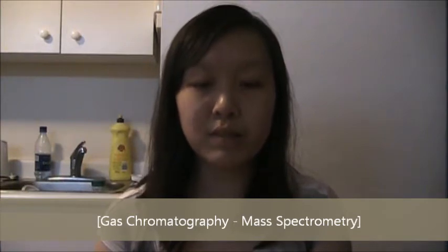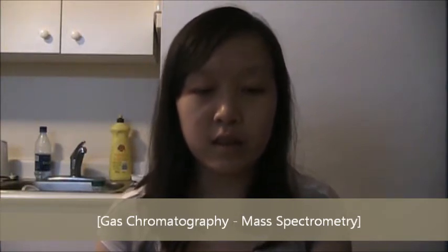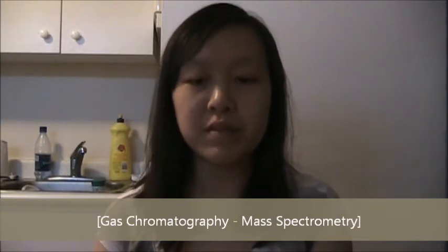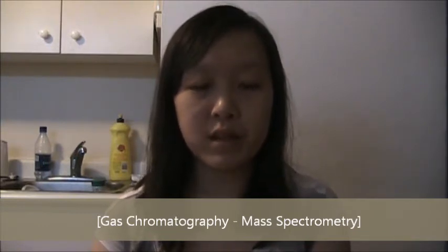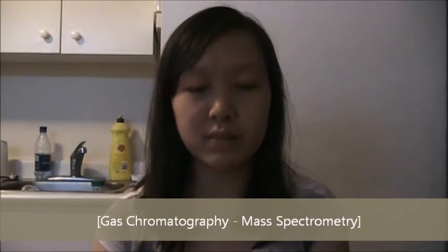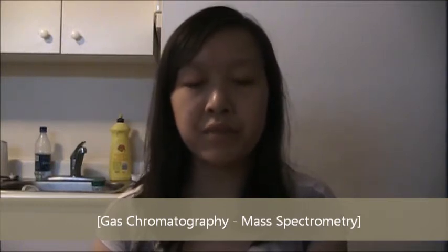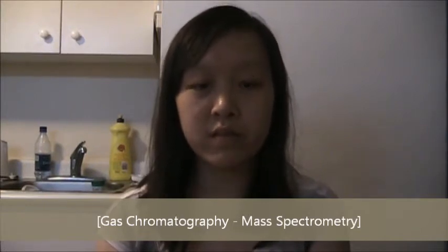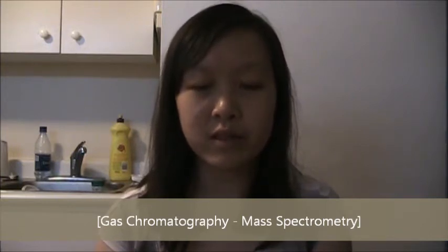The length of time each component takes to travel through the column is called the retention time. The retention time typically ranges from 1 to about 30 minutes, depending on the sample and the specific column used. As each component of the mixture exits the GC column, it travels into a mass spectrometer. Here, molecules of the sample are bombarded by electrons.